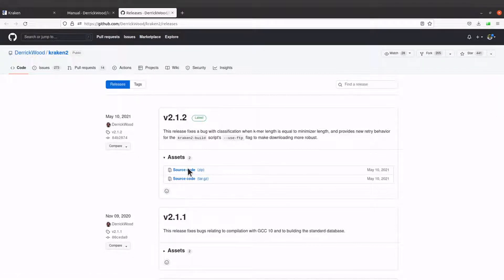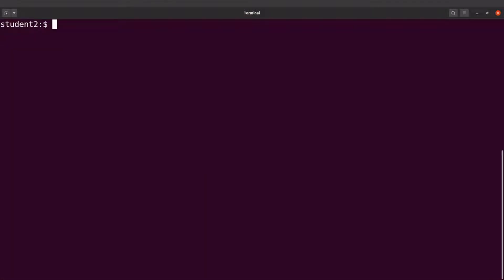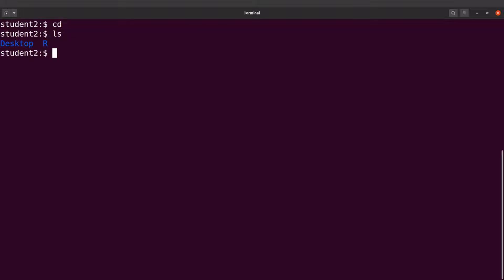You can also click it and that will download it for you if you want to use your browser. But because I'm working on a Linux system — a remote server — I need the link because I will not have access to a browser. So let me go to the terminal now. I am on the terminal. The first thing I will do is CD to make sure I am in the home directory, and then I'll do an LS to check.